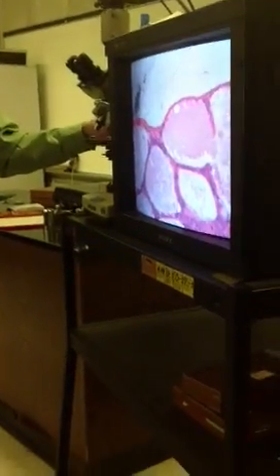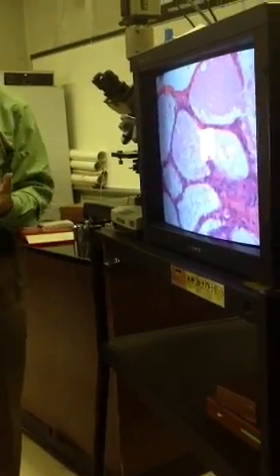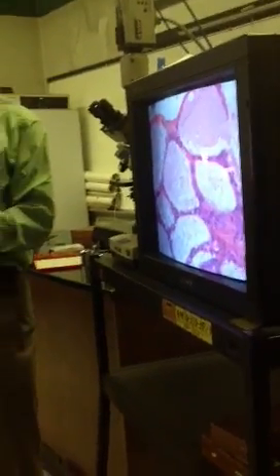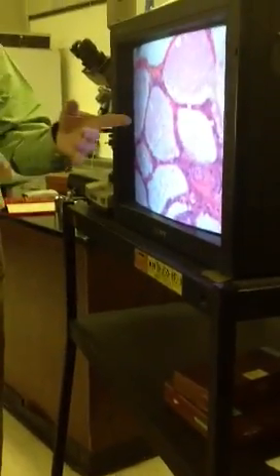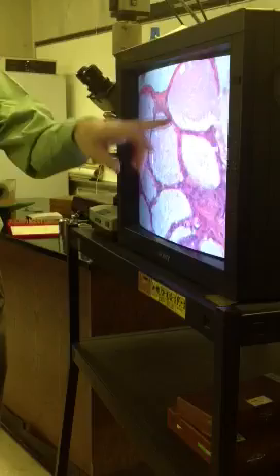This, in a way, looks a little bit like what? Like a little like epididymis, but instead of sperm, it's got milk. It looks a little like seminal vesicle, which basically has nothing. So if I ask you about a lactating breast, it's really going to be this kind of thing.